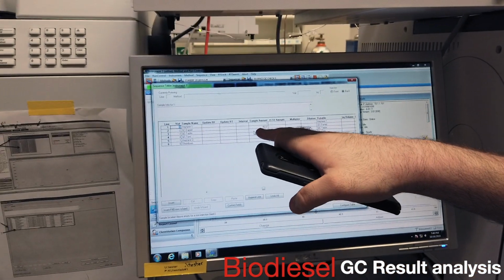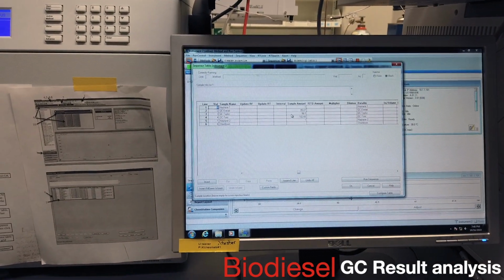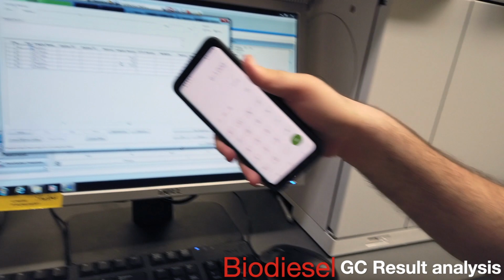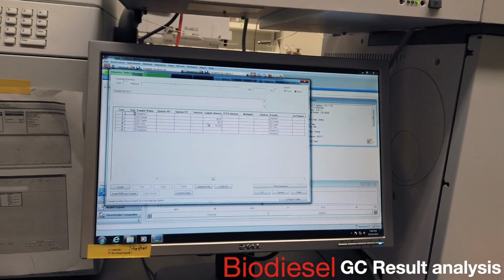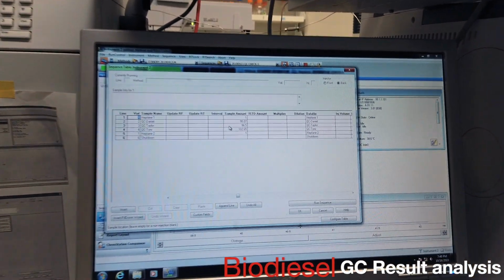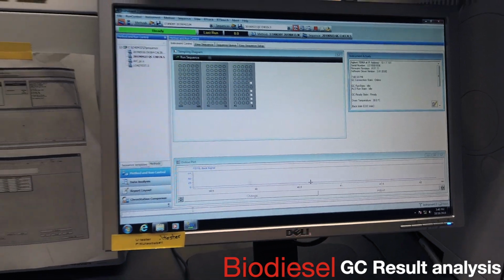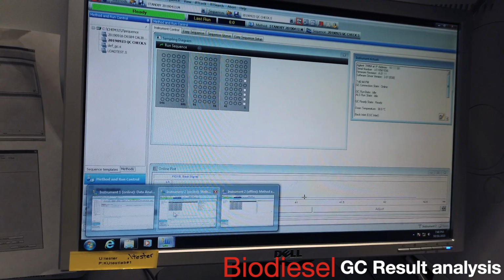This needs to be in grams, and then that'll fix it. So if you do that now, it should adjust, right? Well, this was the sequence table before. But if you adjust the sequence table now, will it? No, I would have to reprocess it. So I could try that. Let me try that. Good. Let's try that.